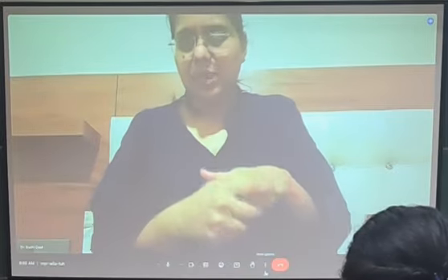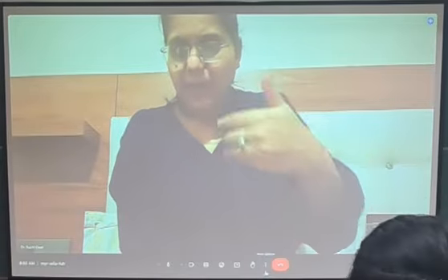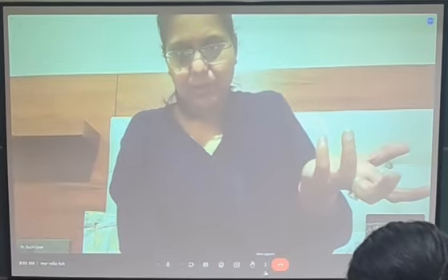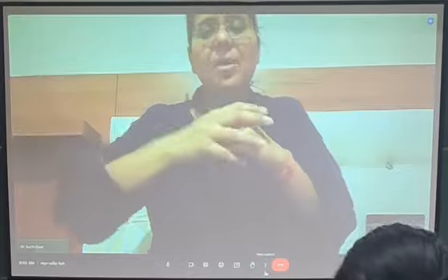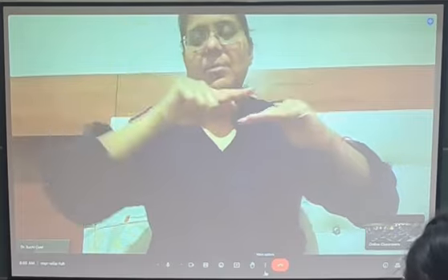My bacterial growth has happened. But you can also use a spectrophotometer to get some number. Like I have talked about, when you work with competent cells, you will get an optical density of 0.4. By the time you come in the morning, your optical density is 3. Actually, if you want, you can plot a growth curve based on your OD.